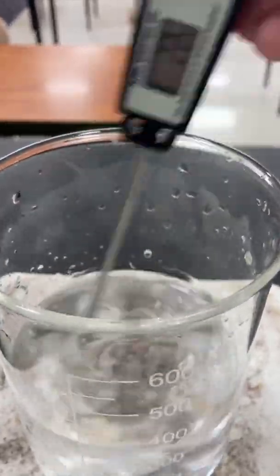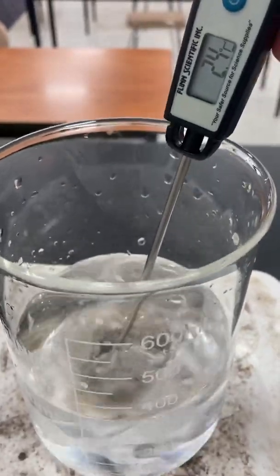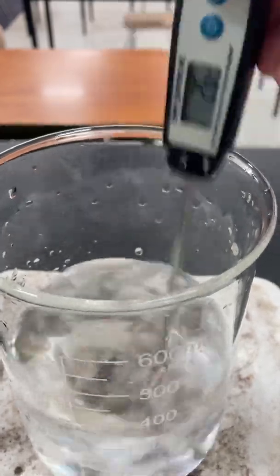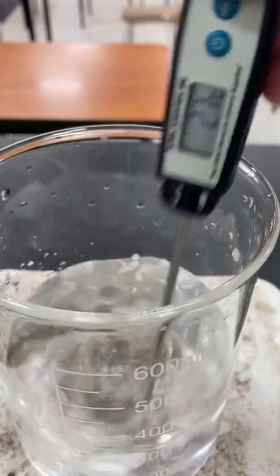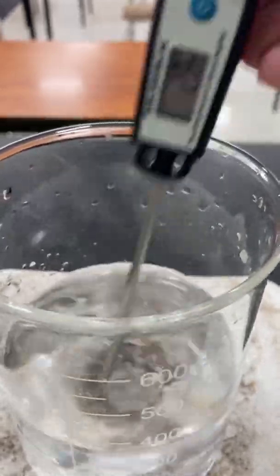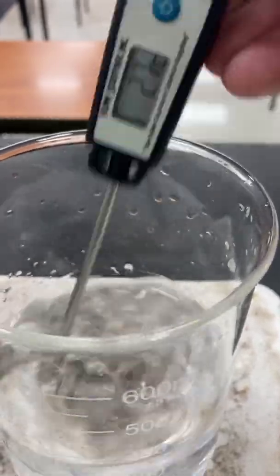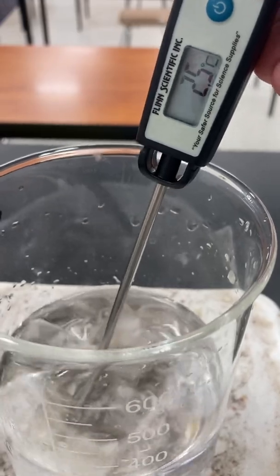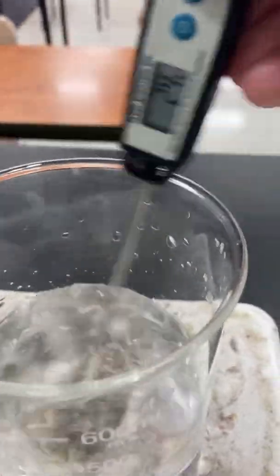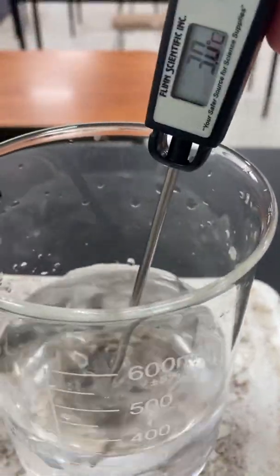So the temperature is not really changing much still. Now I want you to think about, while we're doing this, what is going on inside of this beaker as it's on this hot plate. Okay. 2 minutes, we had 2.5 degrees Celsius there. So look at that, the temperature is barely changing as long as I'm stirring my mixture here.